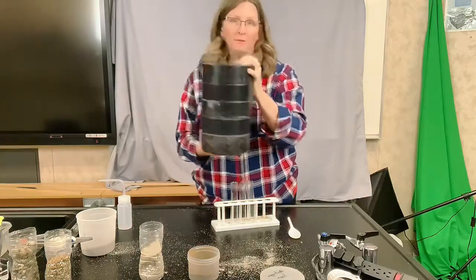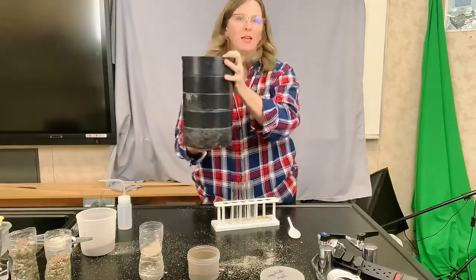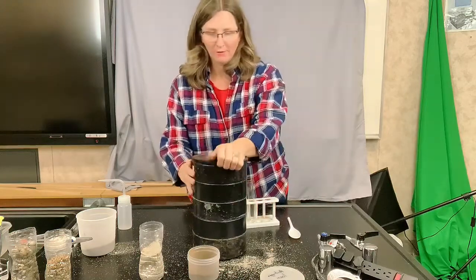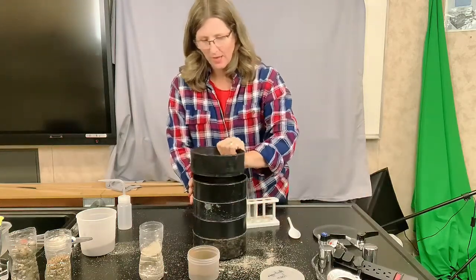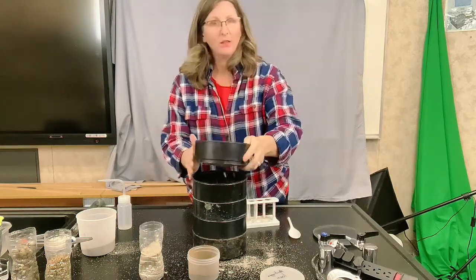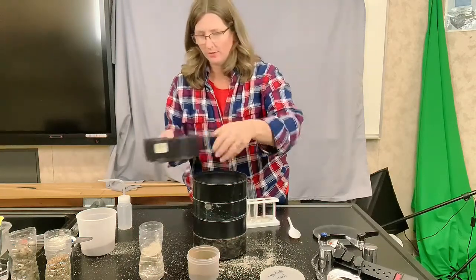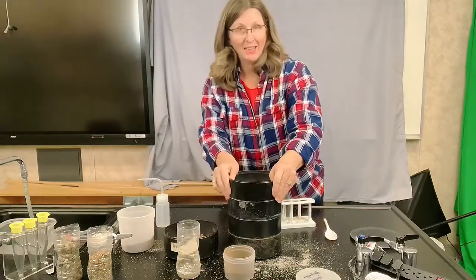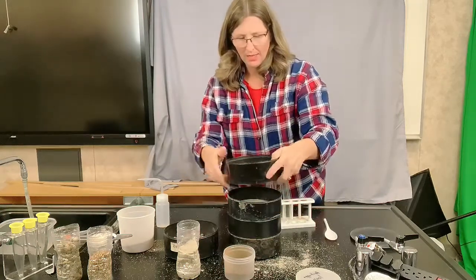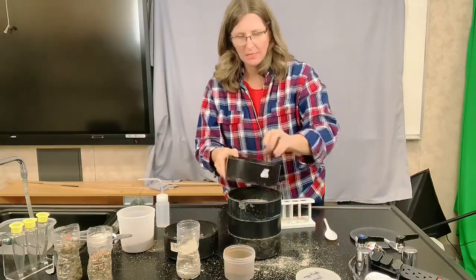So we'll sort each layer, and it's going through this column and sorting it by particle size. That might be enough. So then we see on the top layer the large gravel. So now this is all the large gravel. This was a grit of 5, so that's really coarse. Then we have the grit of 10, which is small gravel, fine gravel. And that's much more what you might see in like an aquarium. All right, so smaller than pea sizes.